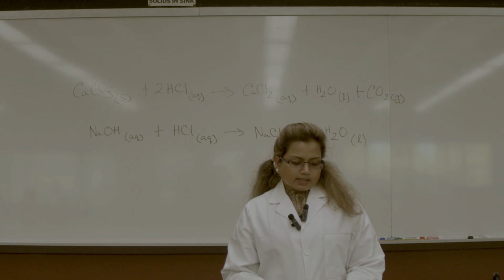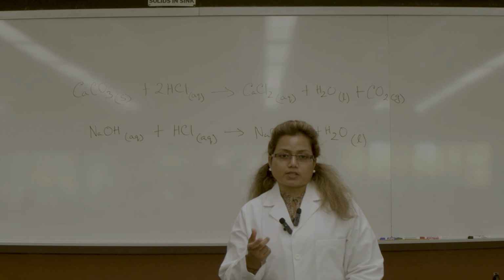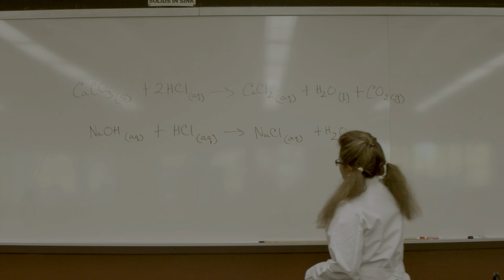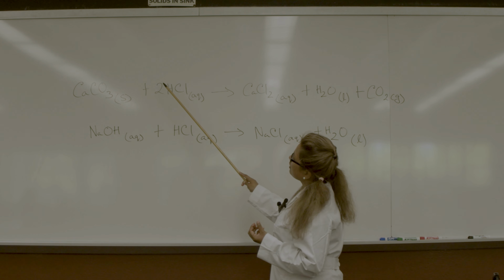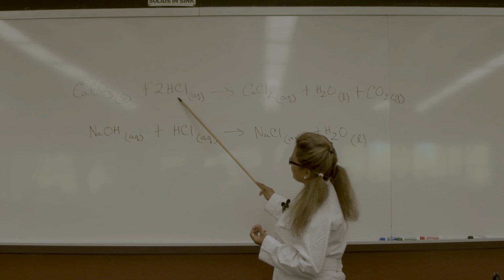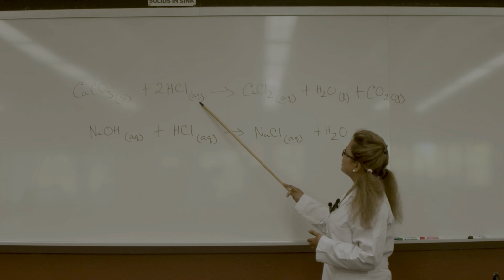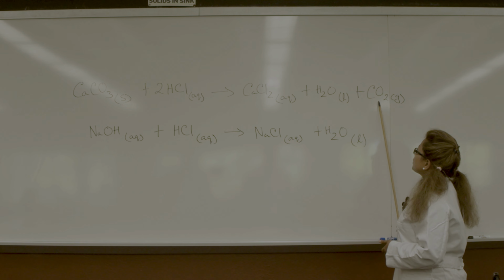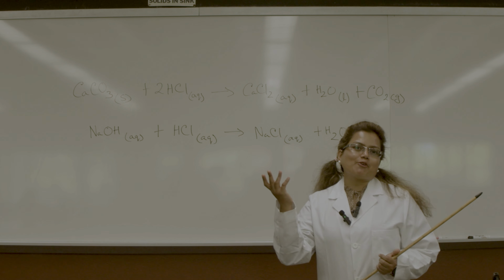What is the active ingredient in antacid, and why do we use it? Calcium carbonate is the active ingredient. The solid calcium carbonate, which forms the tablet, reacts with hydrochloric acid in aqueous solution, because in our stomach there is a solution of acid. They react and produce calcium chloride, water as a liquid, and carbon dioxide gas. And that gas is released from our body.